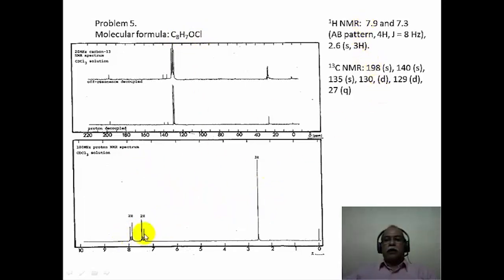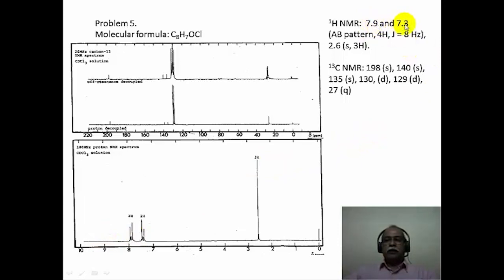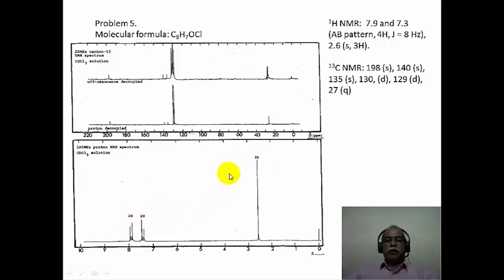Let us look at the proton NMR data extracted from the spectrum. The approximate chemical shift values of 7.9 and 7.3 form the AA'BB' pattern with a JAB of roughly 8 Hz, and 2.6 ppm corresponds to a singlet of 3 hydrogen intensity. The intensities of the various signals are given: 2 hydrogen, 2 hydrogen, and 3 hydrogen — totaling 7 hydrogens in the molecular formula, all accounted for by this integration.